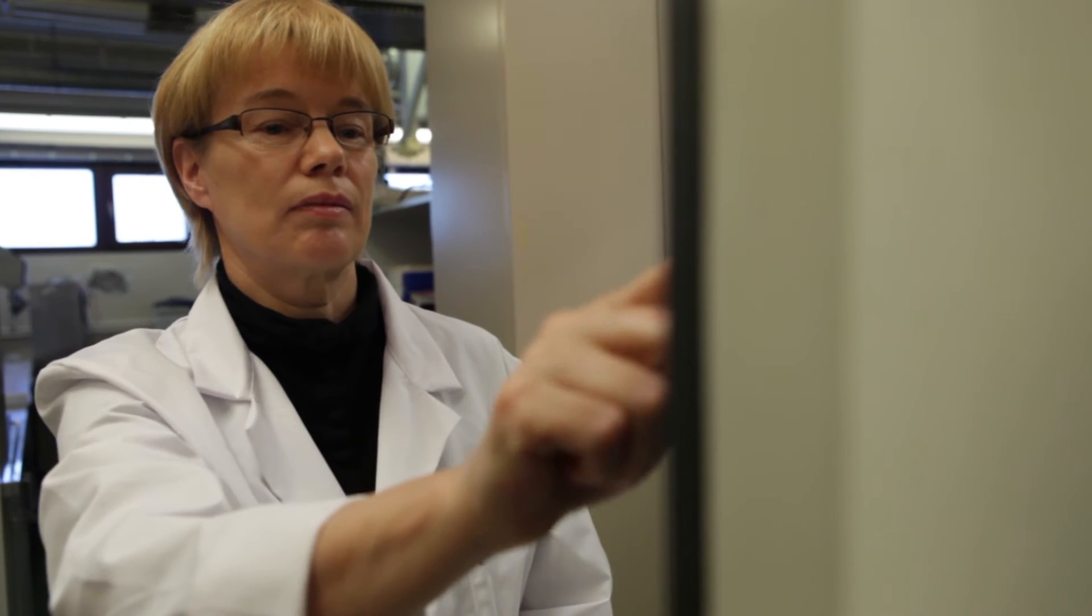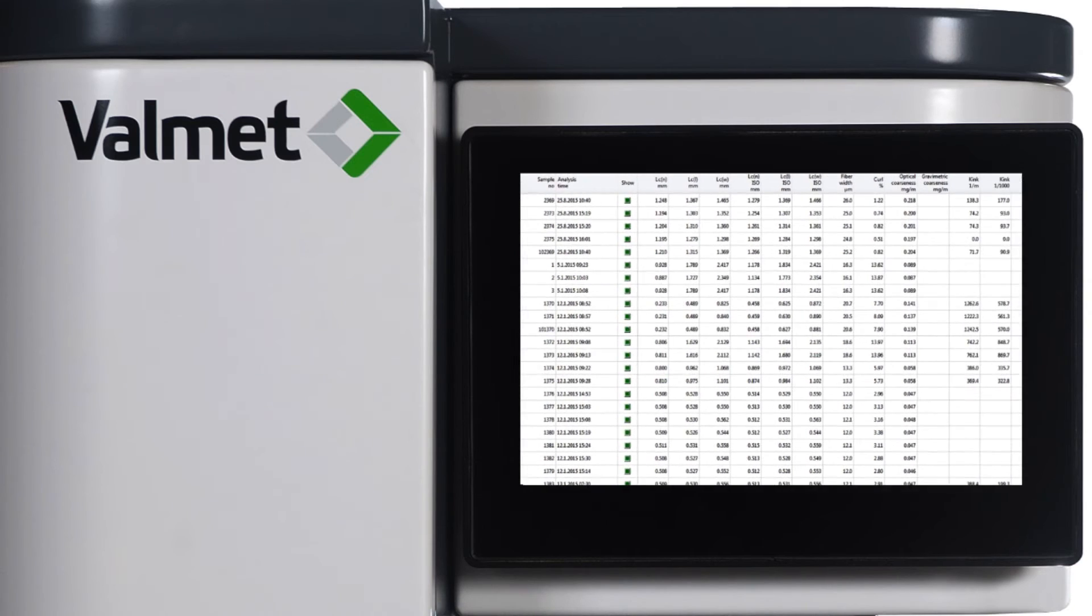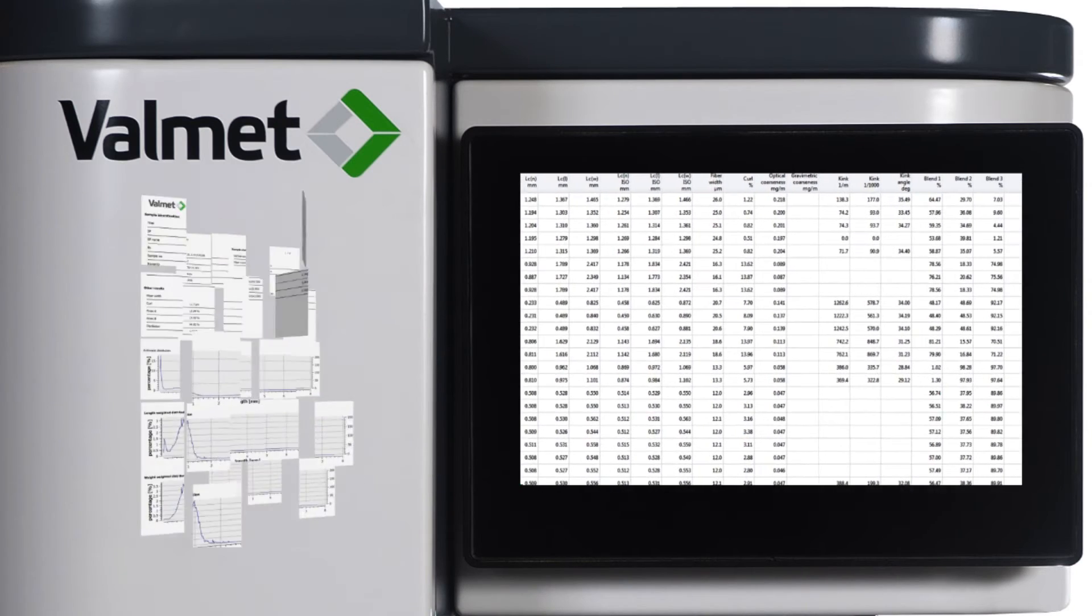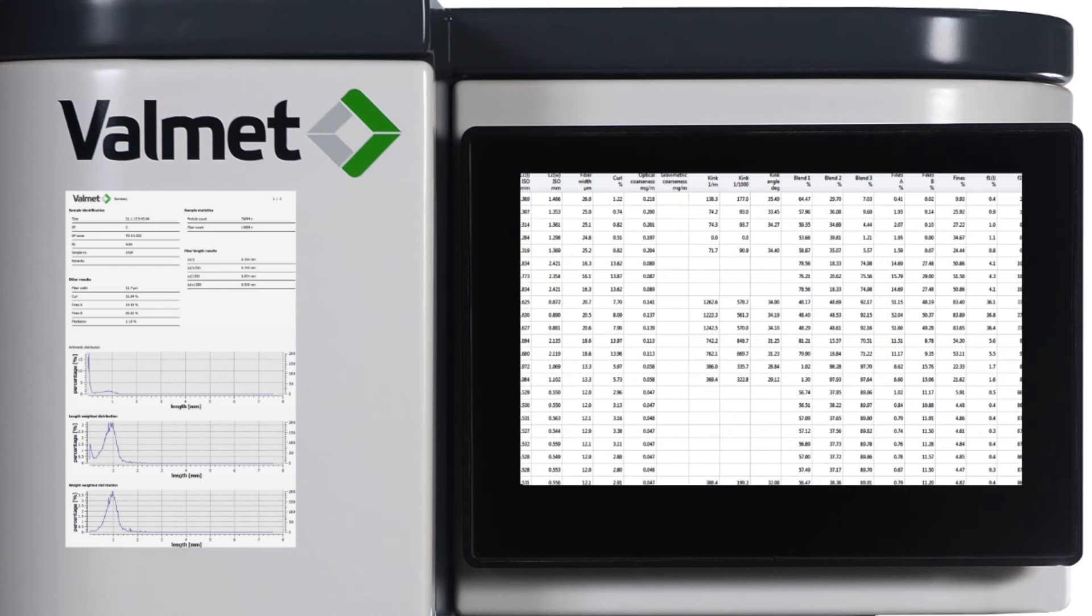With the Valmet FS5 you can easily monitor the effects of changes in your processes, equipment or raw materials or fiber properties over time.